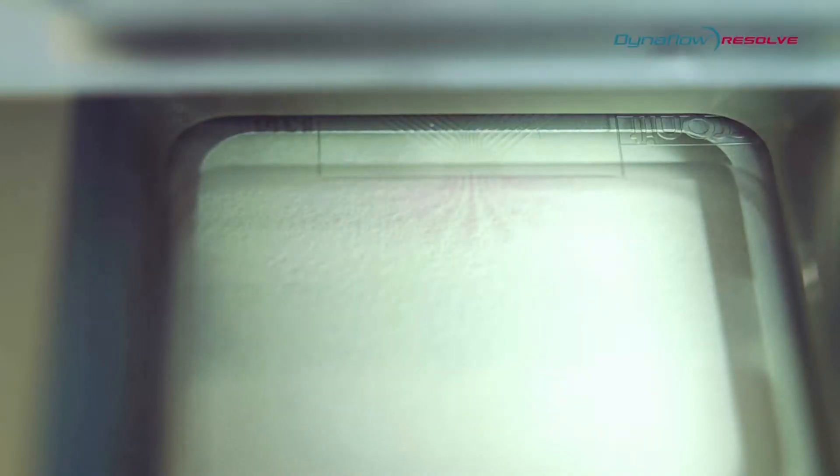The design of the microchannels creates a laminar flow in front of the channel outlets.